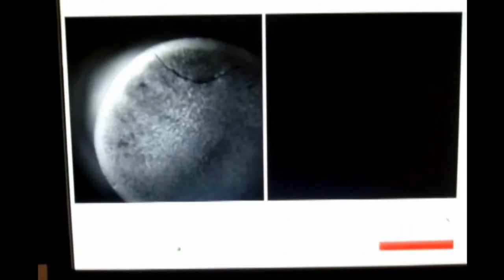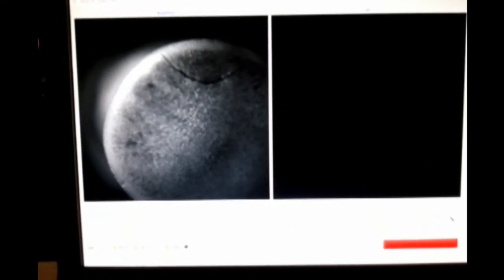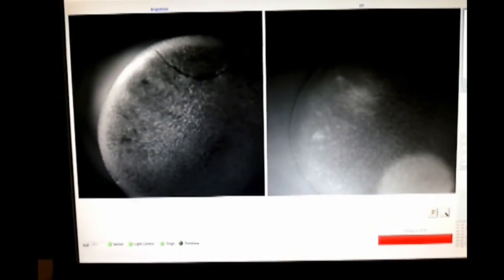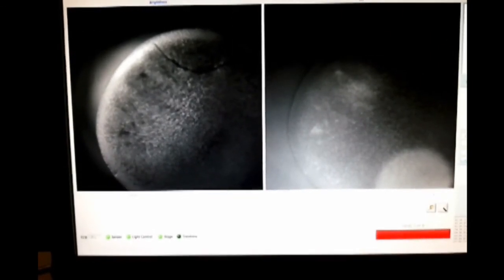Now, if we did not select those wells and clicked on auto scan, then based on the type of plate we have, it'll go through all the wells and all the drops and save the images tagged appropriately, either in the user's folder, or in the case of a database, would store them in the appropriate table in the database.